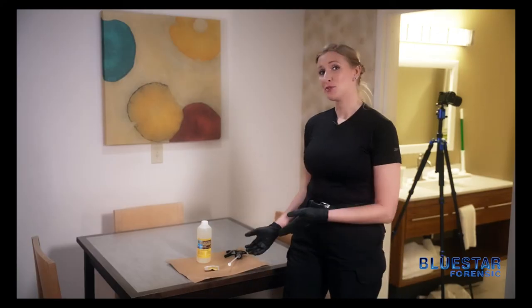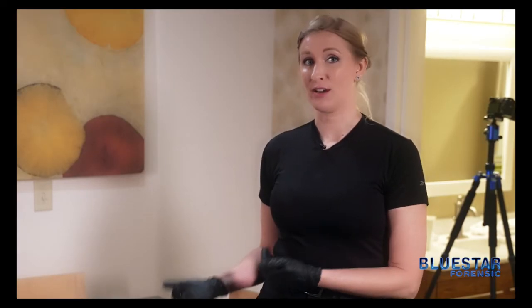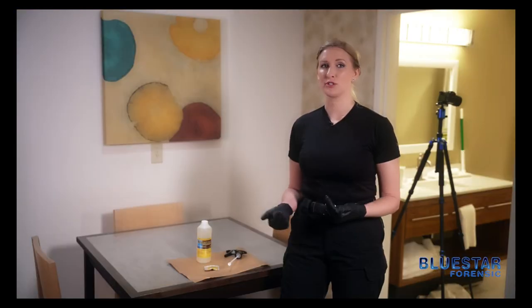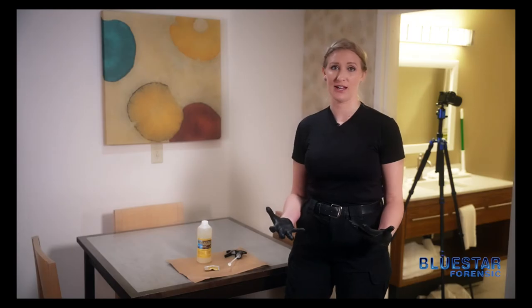Here we have the Blue Star Forensic Kit. Now as always, if you're on a real crime scene, make sure you're either mixing the chemicals outside of the crime scene or you protect your surfaces with craft paper or paper bags, whatever your agency has on hand.